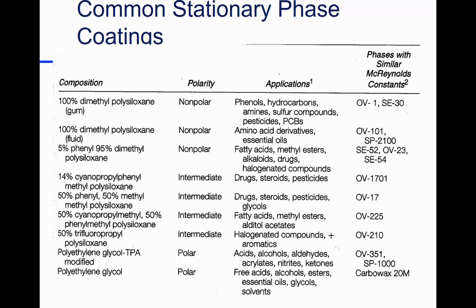But if you're doing a fairly routine analysis, our normal fatty acids we come across in plant materials, we can probably get by with one of these others, and they're more durable. These things, you can do almost anything to. I'll take them up to 400 degrees centigrade, getting close to ashing, actually, and they're fine. What happens to silica? Not too much. So they're extremely durable, and you like to work with them if you can. But if you can't, then we go down here. So it's how complex the separation is that it really is based on.